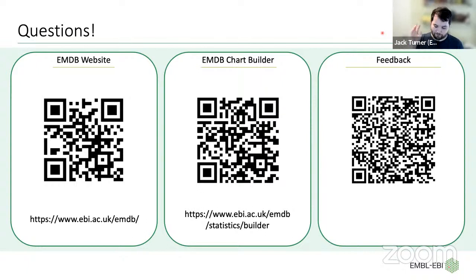The way that the OneDep system is set up, particularly the deposition interface, having these links would be nice, but then we on the side of EMDB and OneDep would have to maintain those links, and if RELION ever updated to do different refinement protocols, we would have to very quickly update those so that we support it. So having this handled on the side of the refinement protocols, actually producing these metadata files that will fill in things, is the direction we're trying to go to make everyone's life a bit easier on that side.